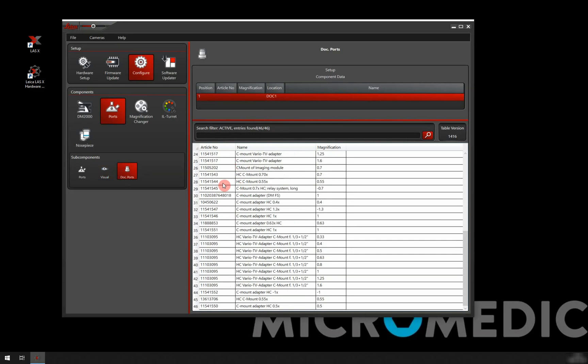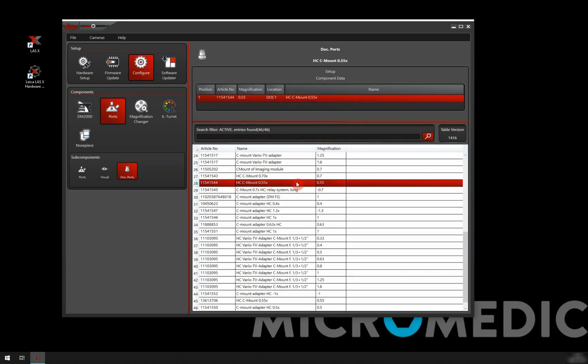Article number is very easy. You just type it in here. I know that this is the one that I have, the 0.55x magnification. So I will just double click on this. And there we go.